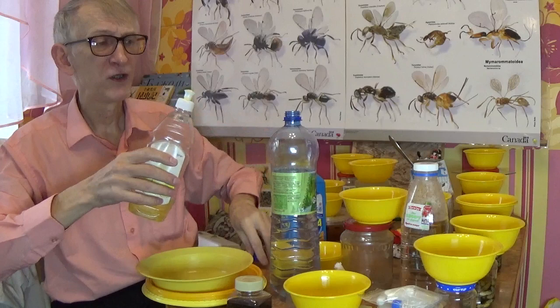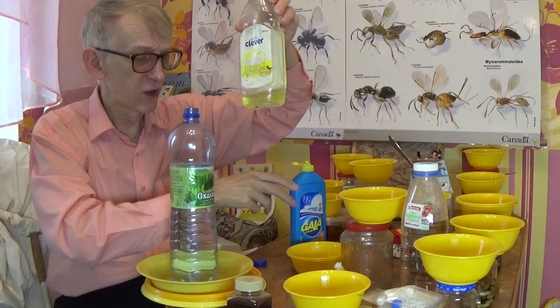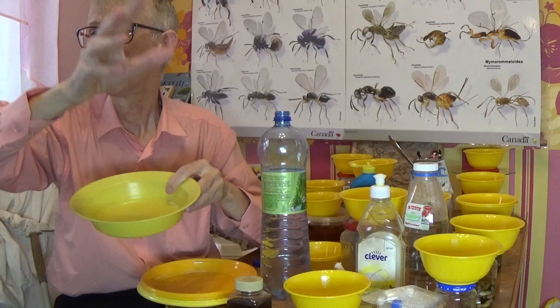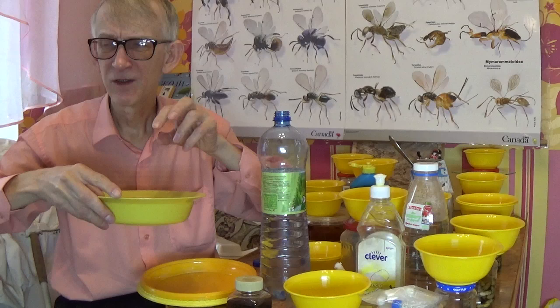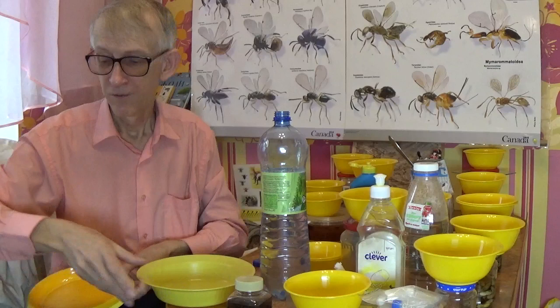Open your bottle and add a drop of shampoo or soft detergent. The detergent decreases the surface tension of the water in the plate, so when insects touch the surface, they cannot fly back out again. With the surface tension reduced, insects and other arthropods — or even some mollusks — will be drawn down and collected.